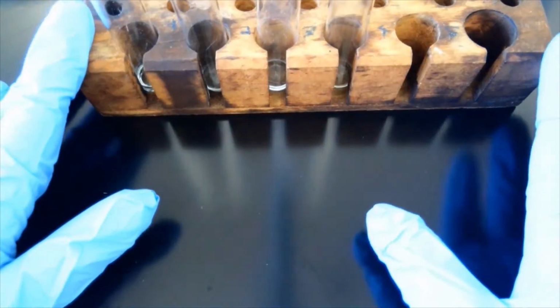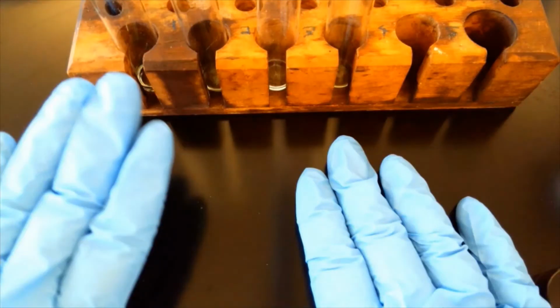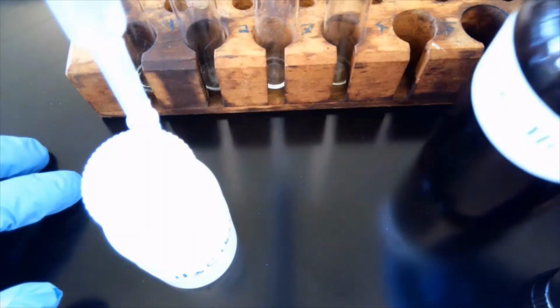And that's where we're going to stop with that one, okay? So we've now compared what happened with magnesium and with zinc, both with our overall vinegar or our acetic acid and our 6 molar HCl as well.